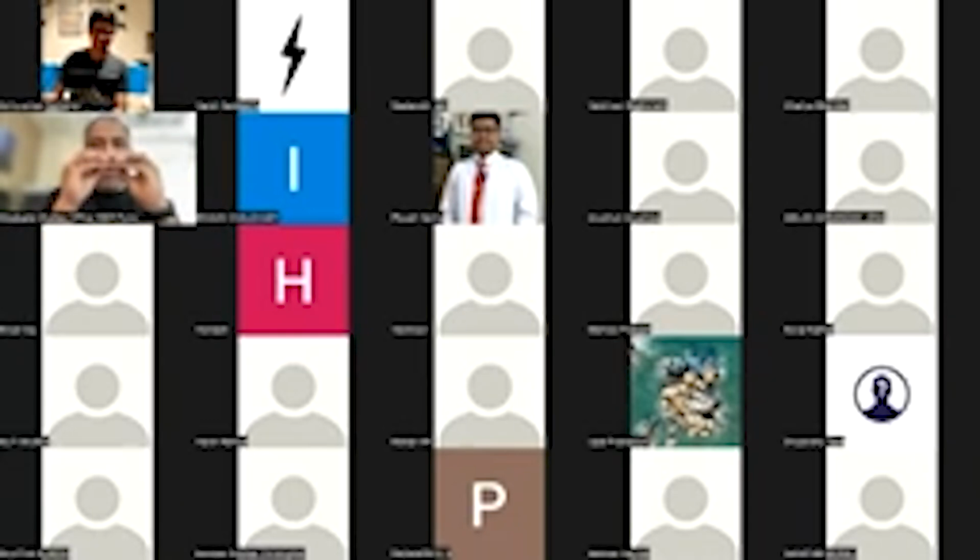So you're able to activate fluorescence with this wavelength and detect fluorescence of this, which lets you see how close these two things are, which then lets you see the conformation of the molecule that they are attached to. So if them coming close together means the molecule has folded in such a way that it has become active, then this imaging will let you see the activation status of the molecule, right? So you are able to do that as well using fluorescence microscopy.